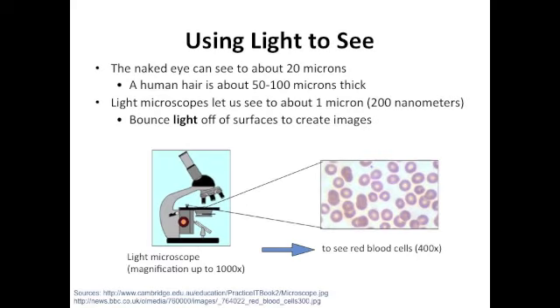So we can use visible light to see our items that we're going to look at, our specimens. These light microscopes, or optical microscopes, can make our image by refracting light with optical lenses. The first microscopes that were invented actually belong to this category, those ones I was talking about at the beginning. The price of an optical light microscope varies from really cheap to nearly unaffordable.